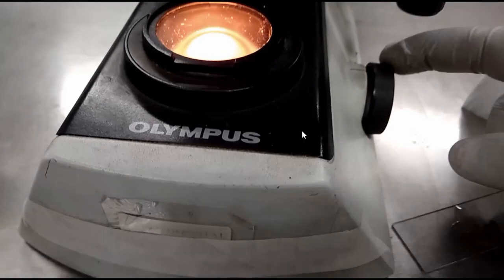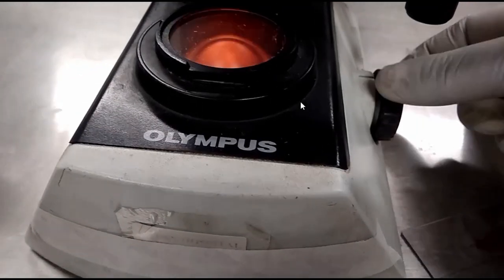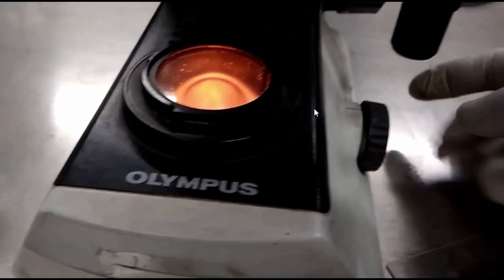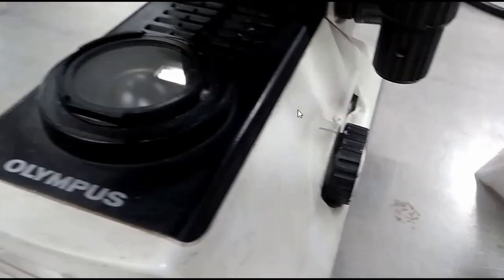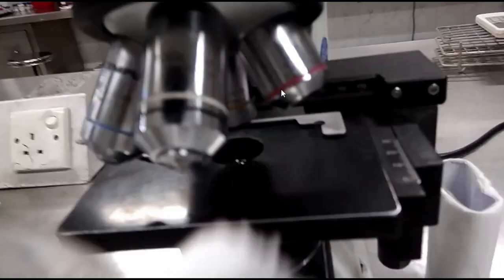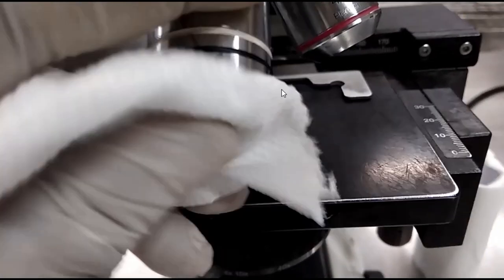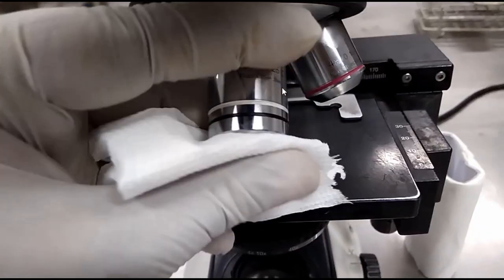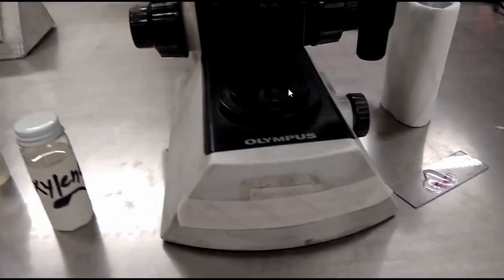If you have to carry this microscope, a point to be noted: put one hand to hold the base and another on the arm, then only carry the microscope. After use, wipe the objective lens with wiping paper. After use, wipe the lenses with wiping paper.